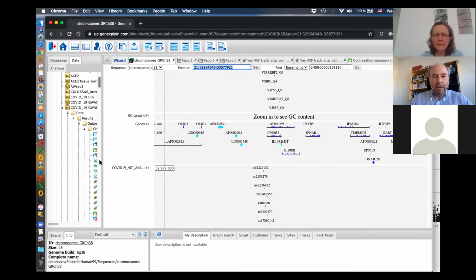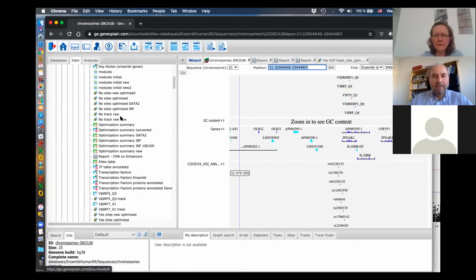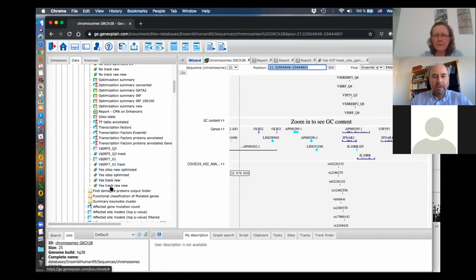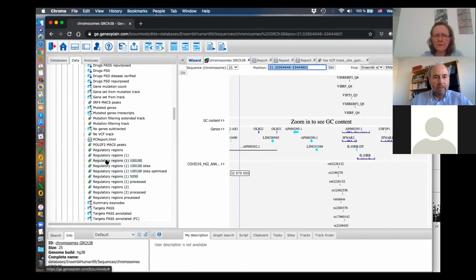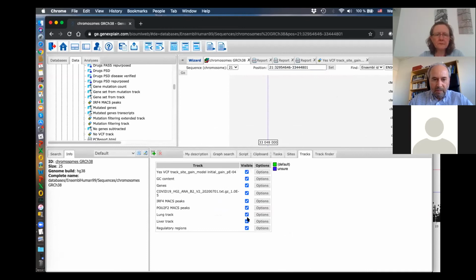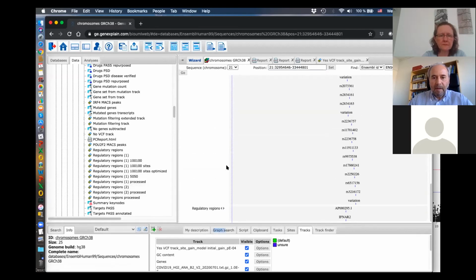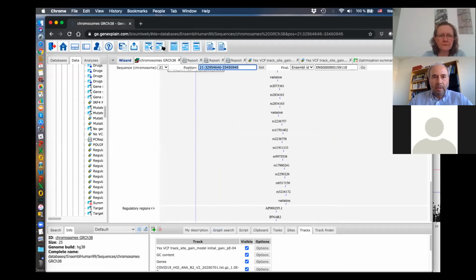So what the algorithm does is first take all those SNPs, and then it tries to find regions where those SNPs have to be analyzed. Here we see these regulatory regions. Let me just drag and drop them here. I will probably take out some of the information. This should be okay. I zoom in a little bit.